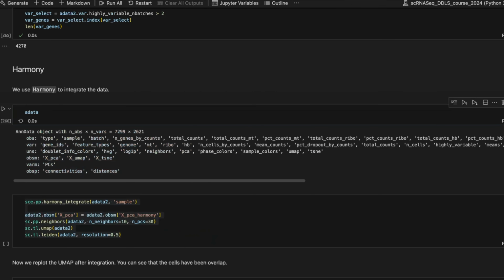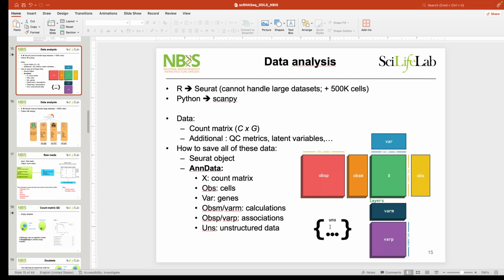So we can first check what we have in the data. We have the obs and var slots, and uns, unstructured, which holds general information that isn't associated with any of the structure in the data. You can think of it like metadata, a given set of parameters that is not possible to link to any of the other variables that we have in our data set.